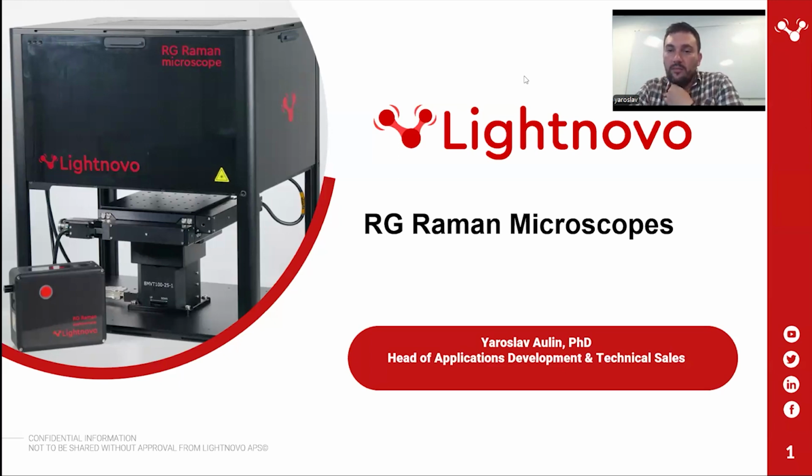According to the application note about microplastics, you use a MATLAB program. Is it possible to analyze microplastics by the program itself? Okay, so actually it is possible to analyze with the program. We have this analysis menu, and in the analysis we have PCA and other advanced features. But of course not everything is implemented in MiroSpec, and it is possible to do more advanced data analysis in MATLAB or Python. I personally prefer Python. But basic data analysis is doable in MiroSpec.